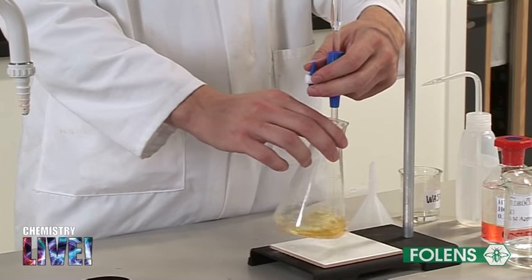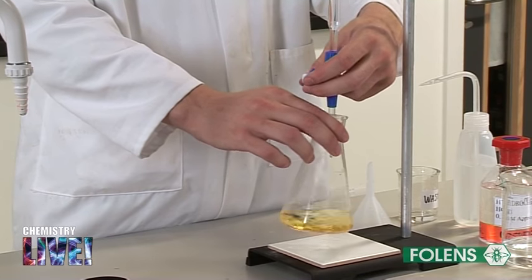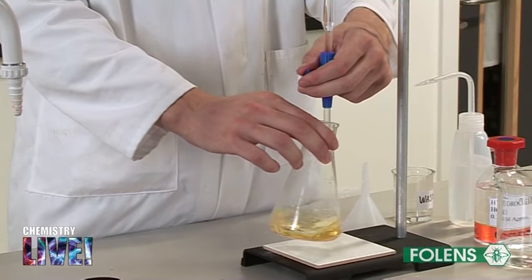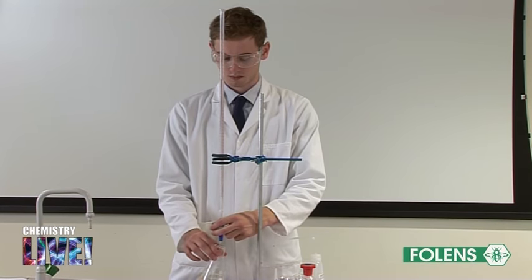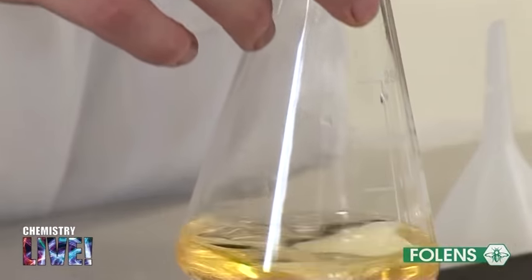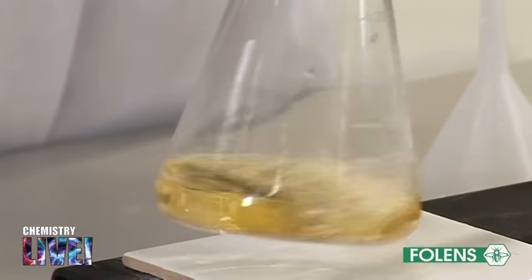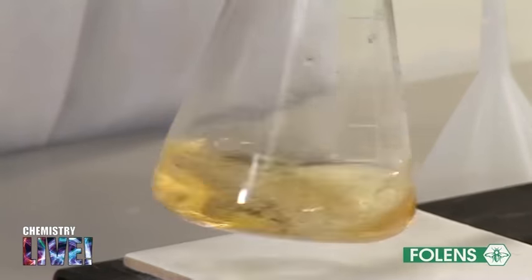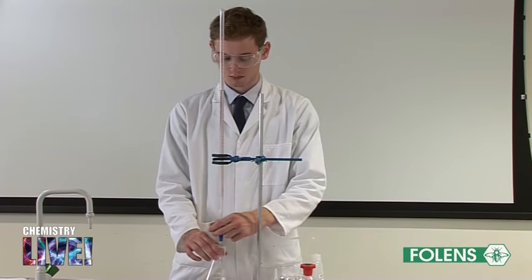Note that deionized water may be added to the conical flask at any stage of the titration. It does not affect the amount of sodium carbonate in the conical flask. We have pipetted 25 centimeters cubed of the sodium carbonate solution into the conical flask. This volume of sodium carbonate contains a certain number of moles of sodium carbonate. Whether we now add 10 centimeters cubed or 100 centimeters cubed of deionized water to the conical flask, this will not affect the number of moles of sodium carbonate present in the conical flask.